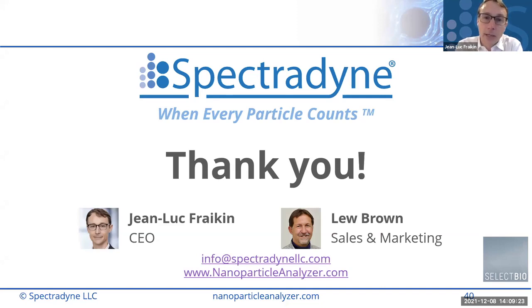And so really what we encourage our users to do is a mind shift, where instead of trying to compare just a single number, move into a distribution comparison mindset where you're looking at the concentration over a given size range. And that's where the power of our technology really shines, I think. Yeah, just to chime in on an example of that, I've seen samples where both are a power law distribution, as you say, Jenny, and good to hear from you.